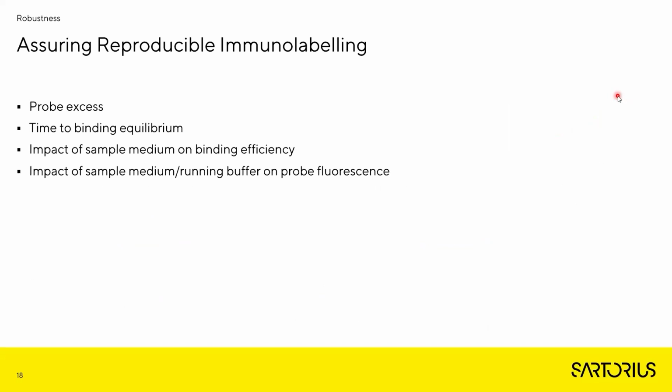So in setting up immunoassays, one thing is always addressed, and this is the probe concentration. Titration experiments are regularly performed with an aim to reach the saturation level and minimize the background in the method.